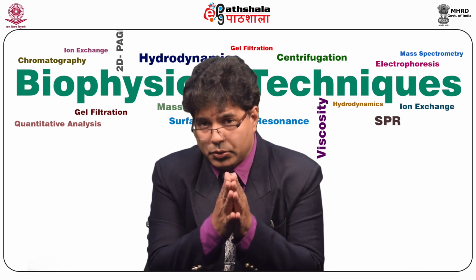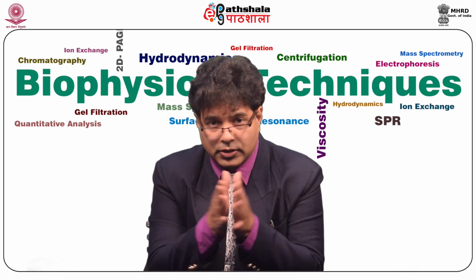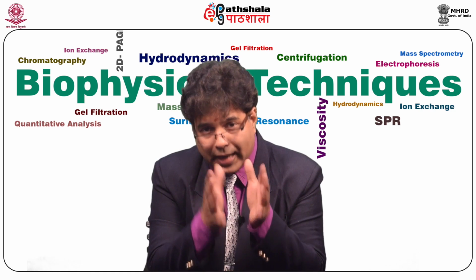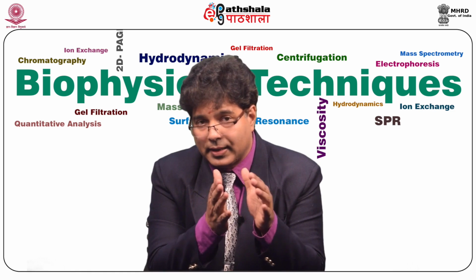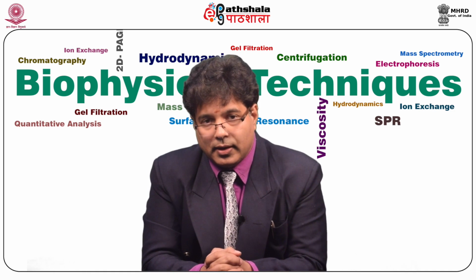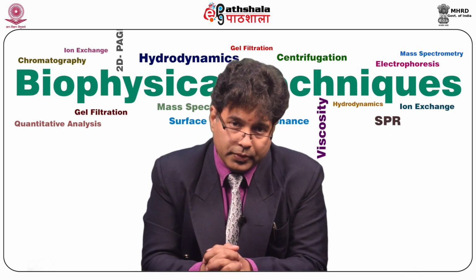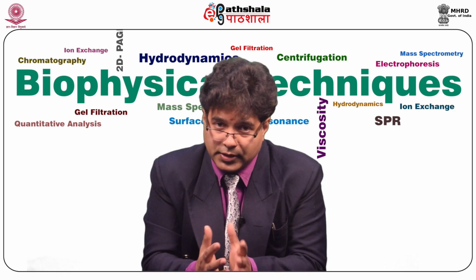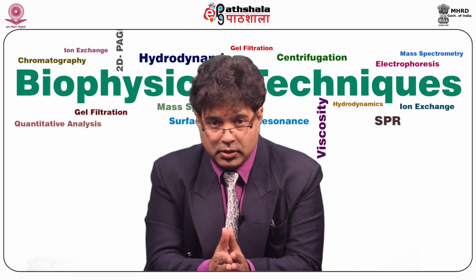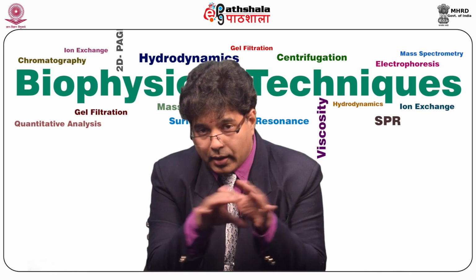Magnetic field deflection, as I told you, is where ions or charged particles, when they are subjected in the vacuum to a magnetic field, deflect. So the instruments which use a magnetic field for this come under the classification of magnetic field deflection mass spectrometers. Whereas quadrupole mass spectrometry is a very significant development, where you apply an electric potential to do the job. The charged ion path is deflected by positive or negative potentials, and these potentials are used in the quadrupole. The construction of the quadrupole and its working principle I will discuss with you later.